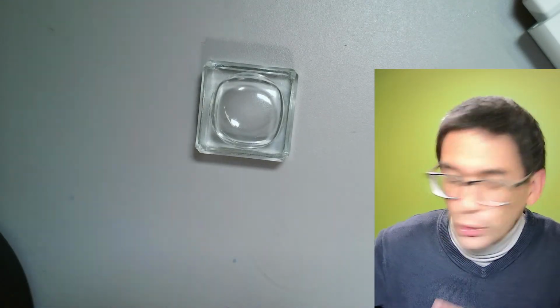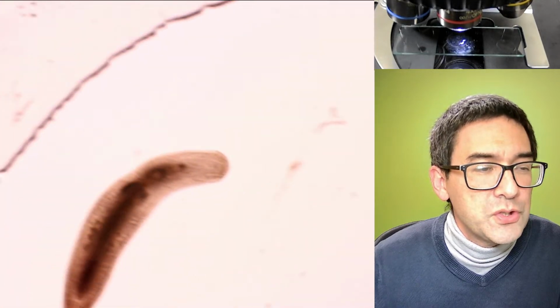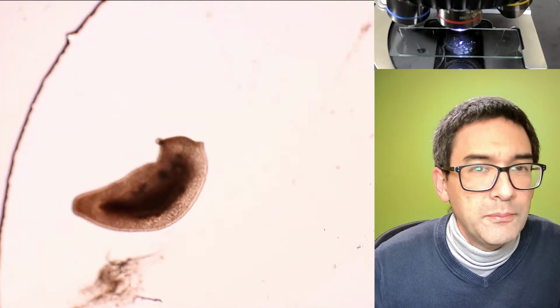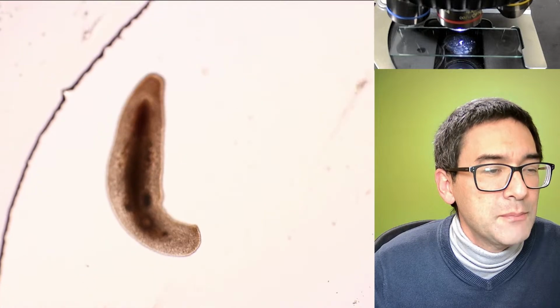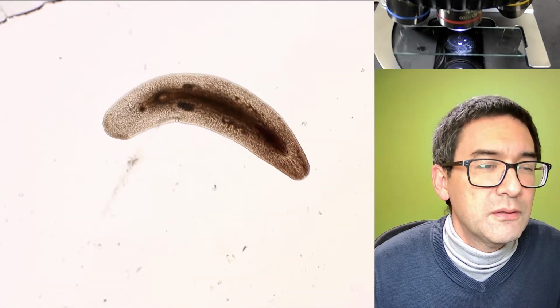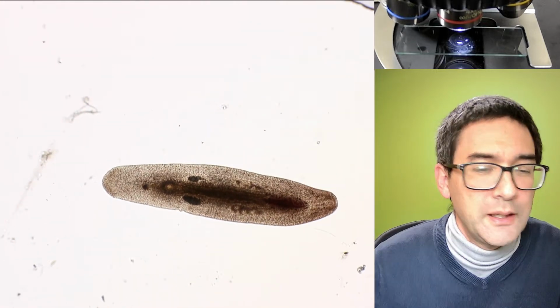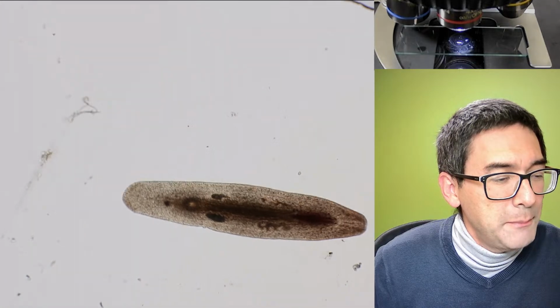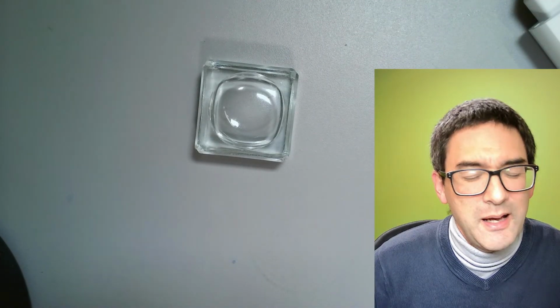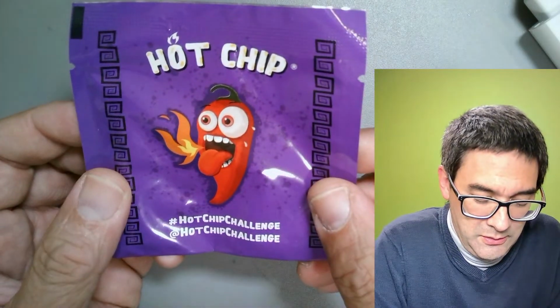I also wanted to show you because I have already prepared the first victim. And the first victim, I hope, is still somewhere floating around here. The first victim is a flatworm, which I collected from some pond water. And we're going to see how it likes to eat the spice. Okay, so that's the first one that I would like to feed it. And we're going to see what happens. Honestly, I probably think not a lot is going to happen, but we're going to see. So this is it.